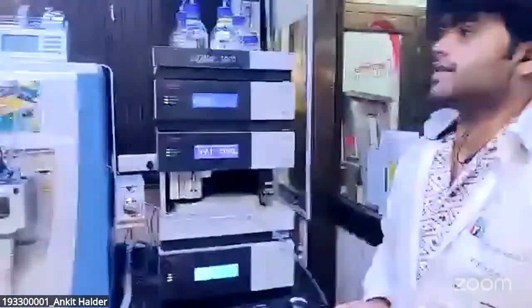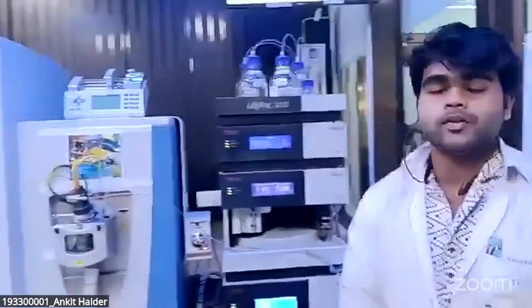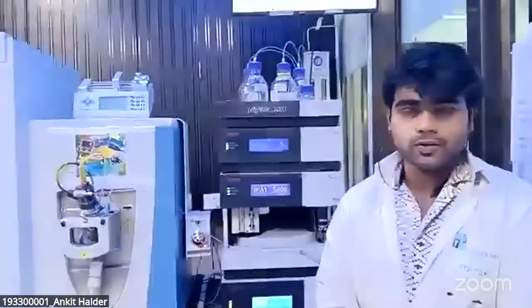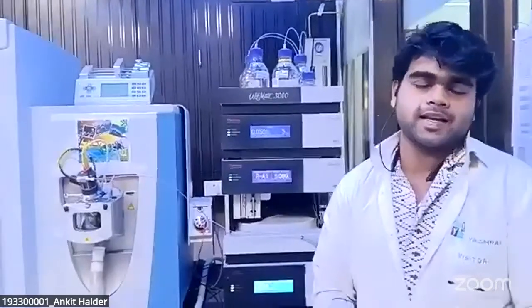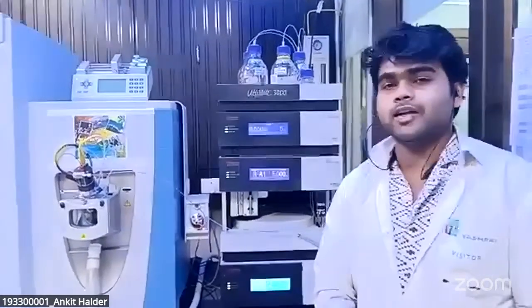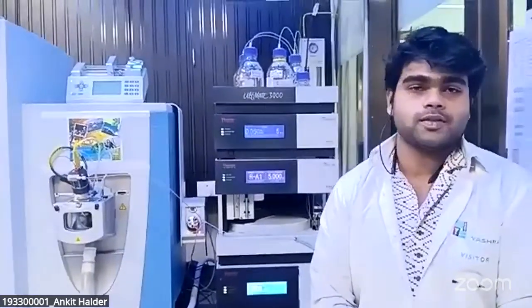So the second aspect that we are going to talk about is the Q Exactive. Right now we are doing both untargeted and targeted metabolomics and lipidomics too. So as Sir said, the sample processing is quite straightforward. You will have the chromatogram and you will get the layers for both the metabolomics and lipidomics.